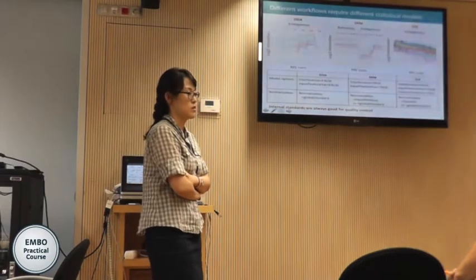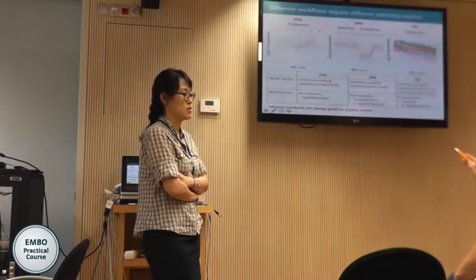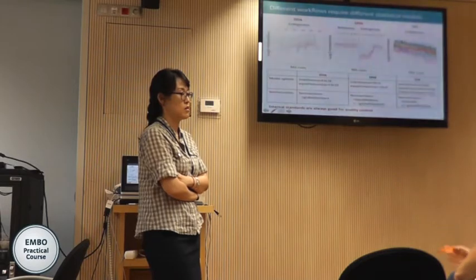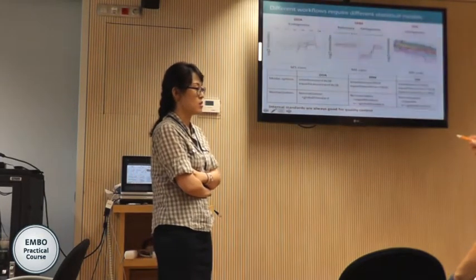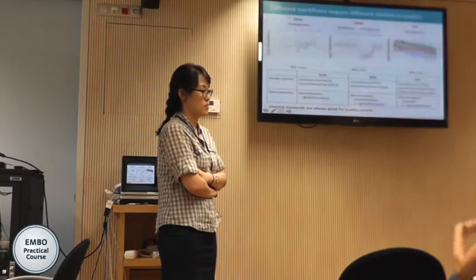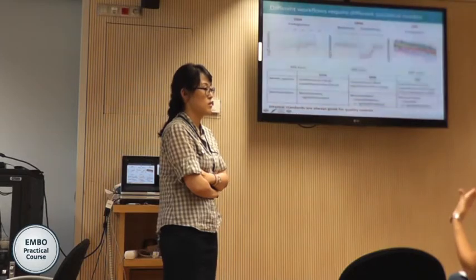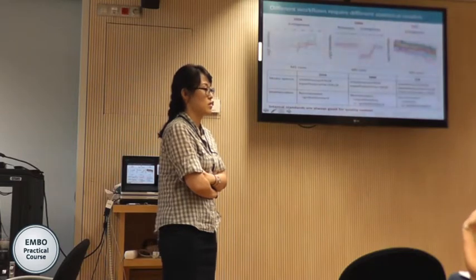To be on the safe side, wouldn't it be better to always put the variance to false, or is there any penalty in terms of sensitivity or speed for doing that? I mean, you say that in SRM you recommend that the feature variance is unequal. But if I'm not sure whether the variance is the same, and I put false, am I less sensitive or not?